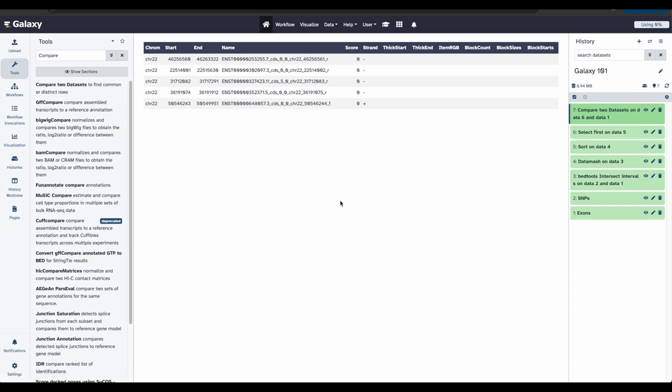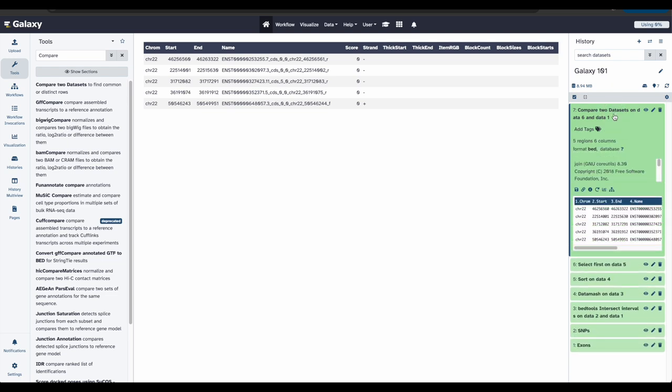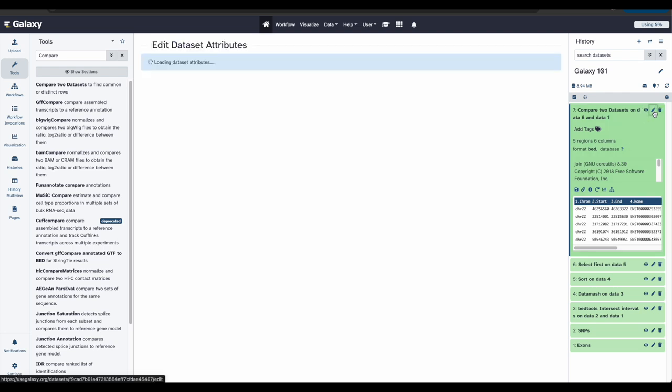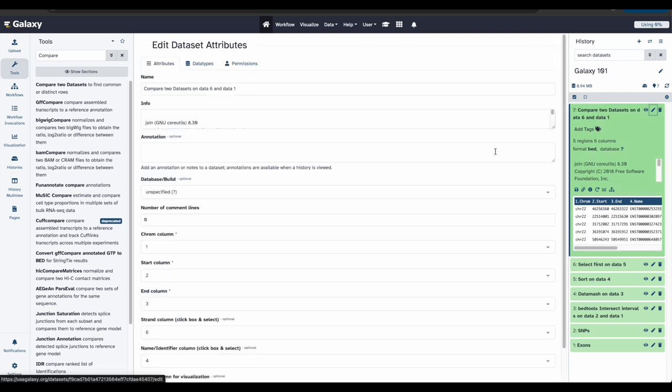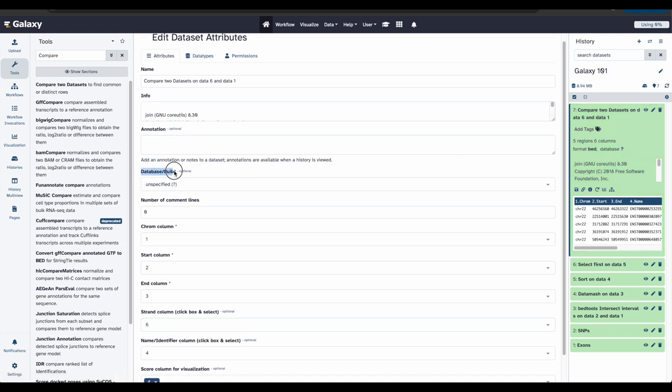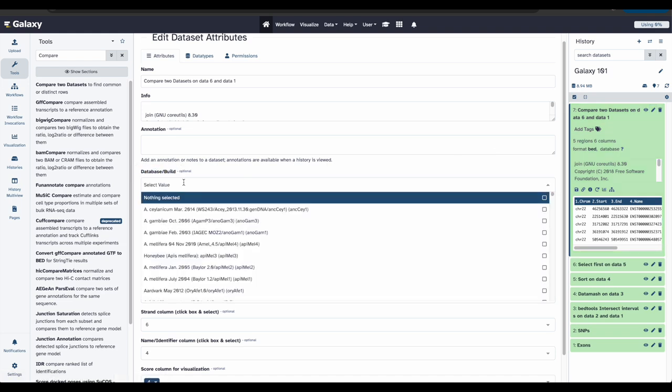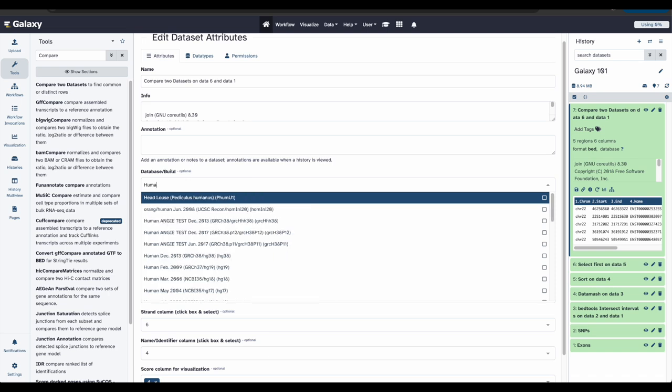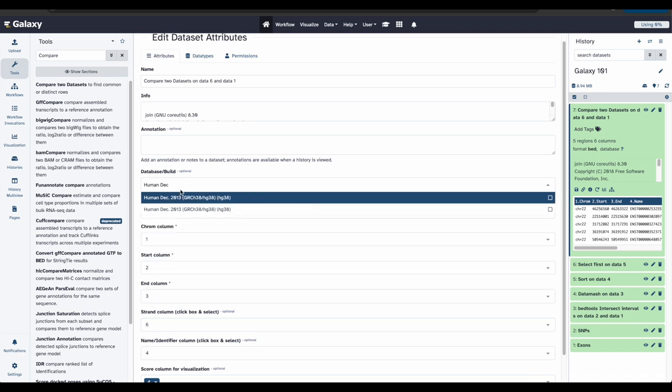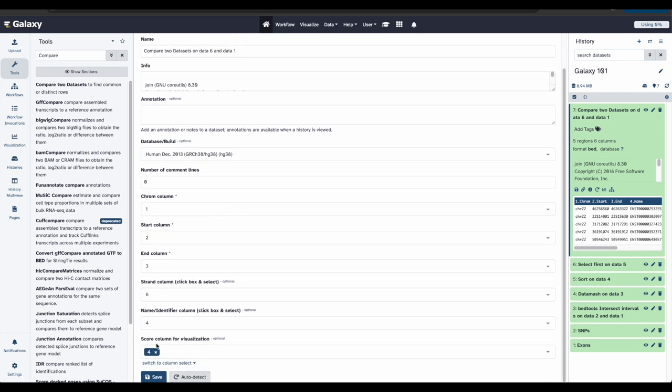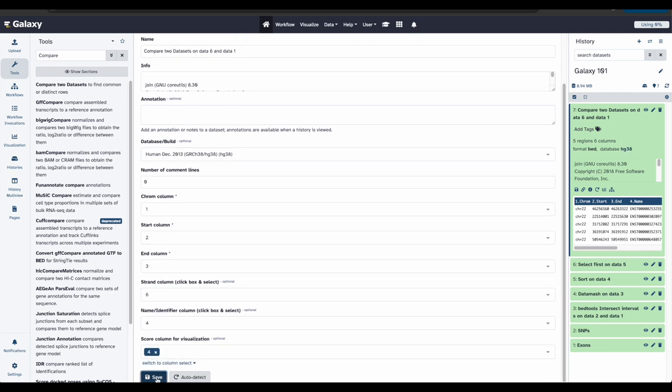To do this, we first need to check if the database of our last history set is correct. And we are looking for a data set database type HG38. So we can do that by going over here and clicking on our last data set and expanding. Right here, we can see that the database is listed as unknown. And so we need to update this. To do this, we're going to click the pencil icon. And we're going to modify the database build section right here. And we're going to do this by searching human. And we want the one right here that ends with HG38. We're going to click that, scroll down, and click save. And now let's double check over here. Yep, it has been updated to be HG38.